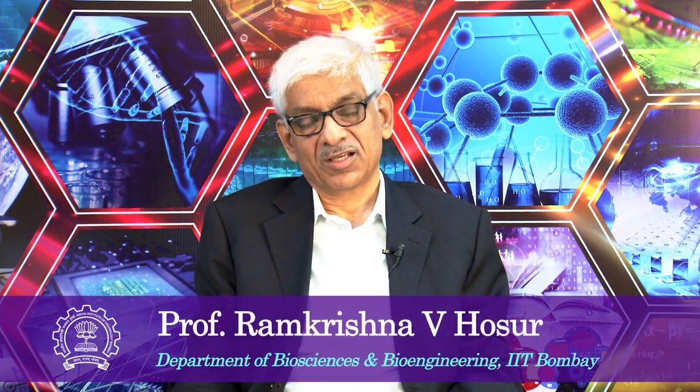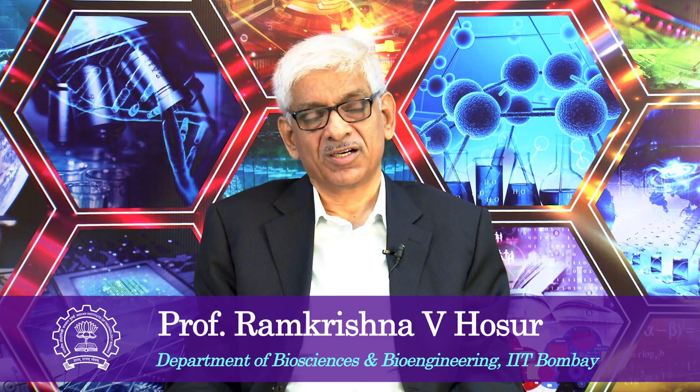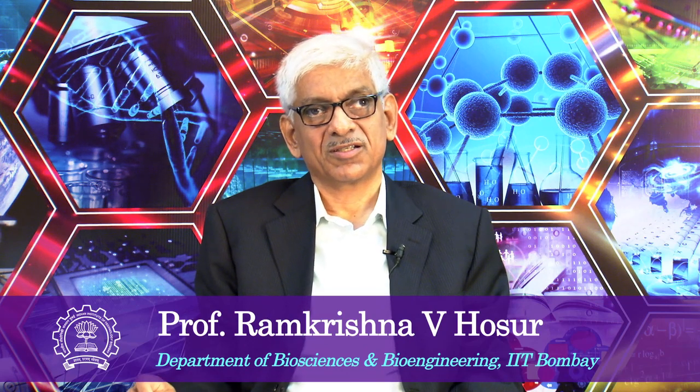We are now going to discuss a new concept in two-dimensional NMR. So far we discussed different types of 2D experiments, 2D separation of interactions, namely the chemical shifts and the coupling constants along the two dimensions of the 2D NMR spectra. We discussed correlation experiments where spins which are coupled in one way or the other can be understood by looking at the correlations in the two dimensional spectra.